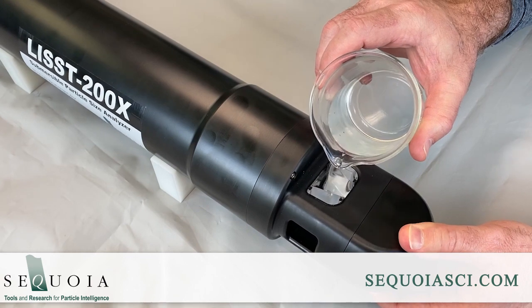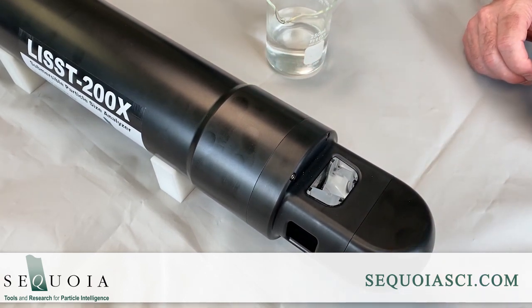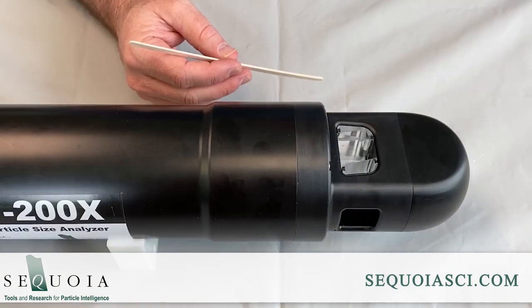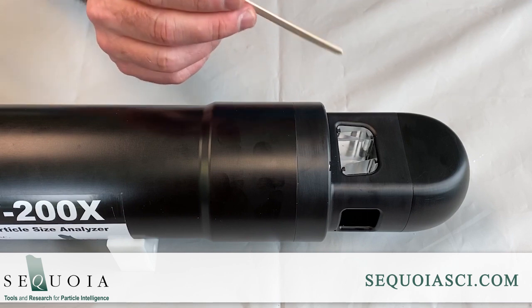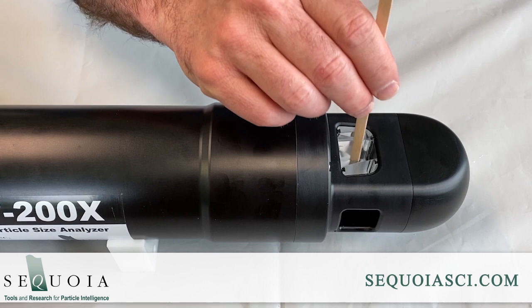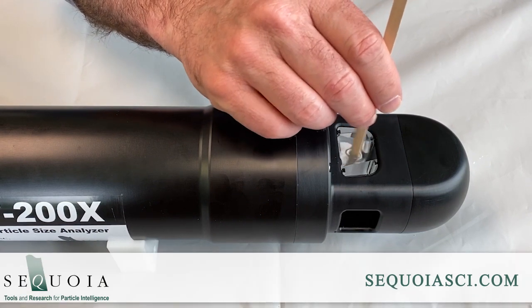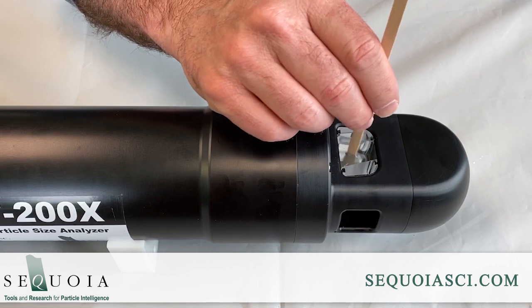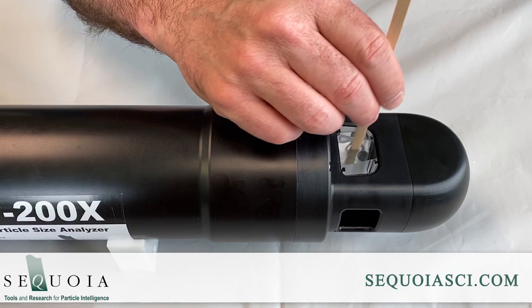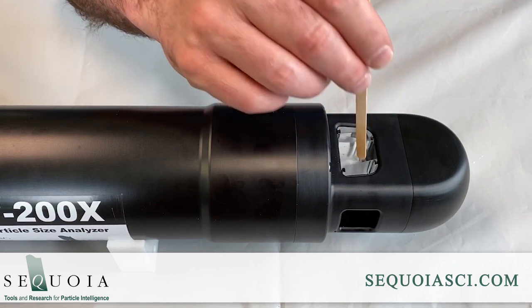Pay close attention to the background water temperature. The water and instrument should be at the same temperature. If temperatures are different, it can impact the quality of the background. The background scattering measurement is critical to good instrument performance. It is especially critical for clean water applications, where the optical transmission is greater than 90% over the 2.5 centimeter optical path. The background scattering will also check the overall health of the instrument. It will verify that all the systems are functioning and that the optics is still in alignment.